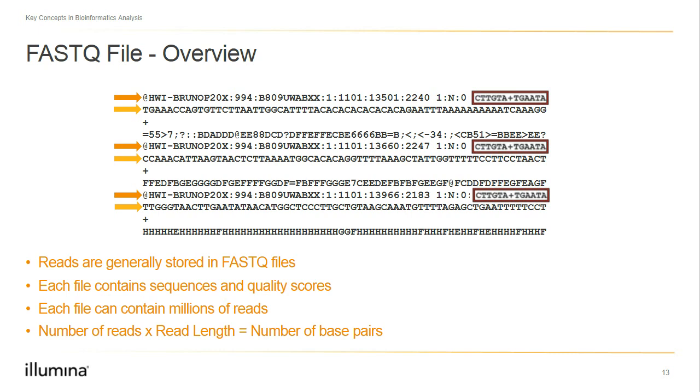The next line is the delimiter. The character used is a plus sign in this case. The last line shown here is the actual quality score shown in an encoded format. Each character that matches up with a corresponding base call has an associated ASCII number, and then we subtract 33 from that number to obtain the Phred score for the base call.